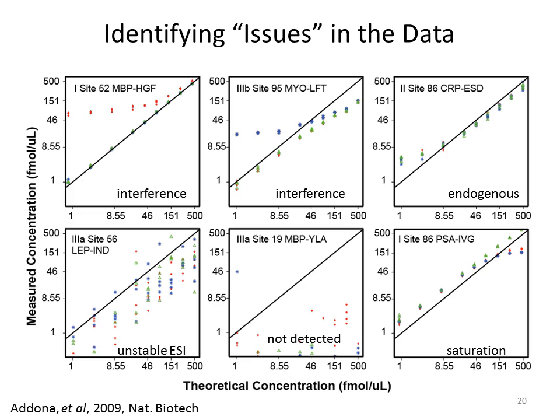So this is one where it's all over the place. There's no correlation. It was not detected. This black line is the theoretical, what we would expect the response to be. And so this was not detected, which if you saw the data, you would understand. This is the peptide from myelin basic protein. This was the N-terminal peptide that got chewed up by exoproteases, and so it should have been there. It was there when we spiked the peptides in, but when we spiked the protein in, we didn't detect it.